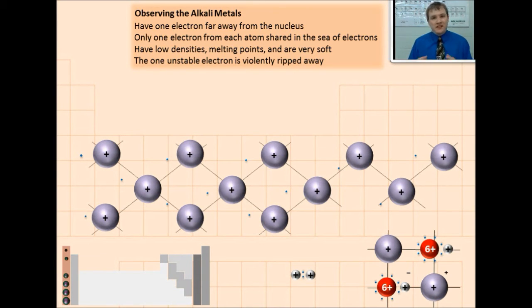When you see that this sodium metal appears to light on fire, what's actually happening is that hydrogen gas, which is extremely flammable, is gaining so much energy from the sodium below it that it ignites, and then the whole thing is going to blow up in all directions because the hydrogen will explode. That's what you're going to observe with the alkali metals.